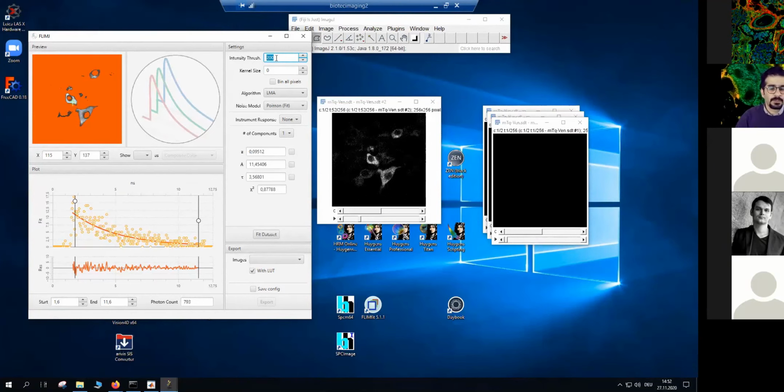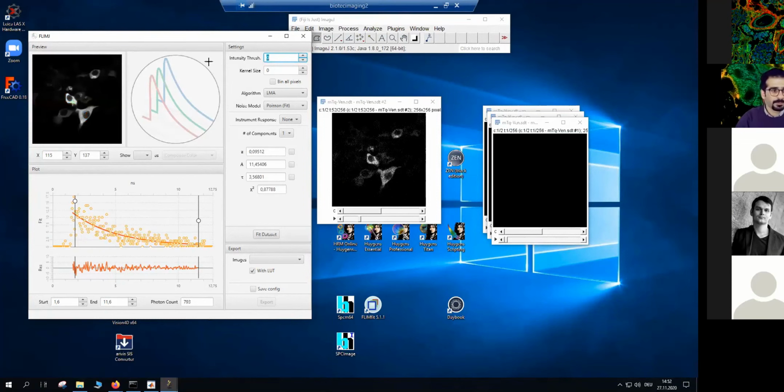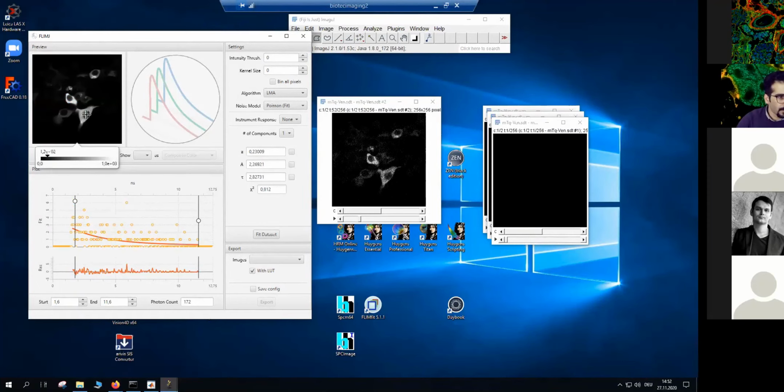I would like to get some information. Nothing. 0. I would like to do this before. Yes. It's 130, 150 inside the nuclei. So I'm not expecting to see any signal in the nuclei.